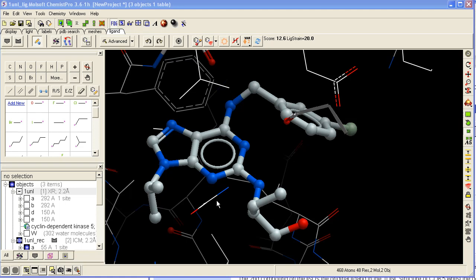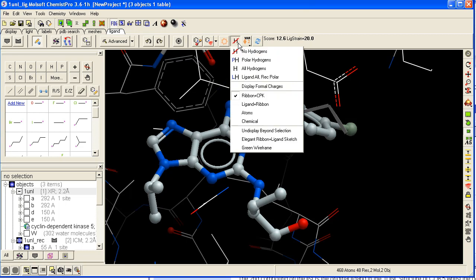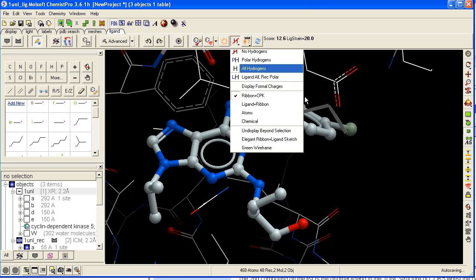How to screen a database of substituents. First, display the hydrogens of the ligand or all hydrogens.